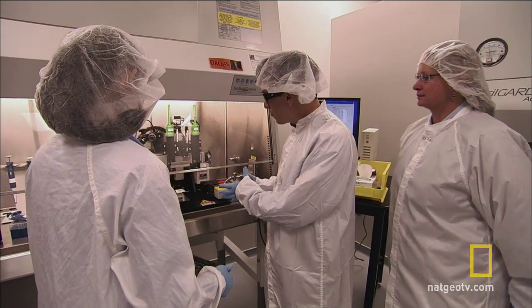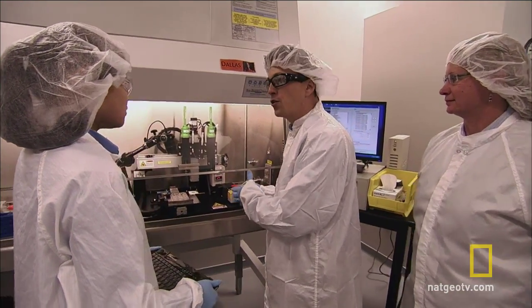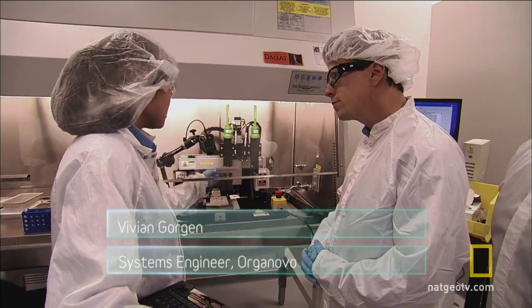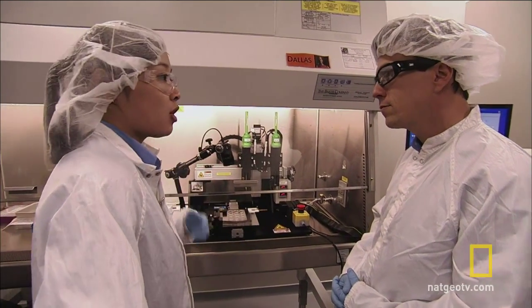Hi Vivian, so we've got the printer here. I see two different cartridges. What's in the cartridges? So if you look at this cartridge here, we actually have liver source cells and in this one here we have cells that make up a lot of supporting material.